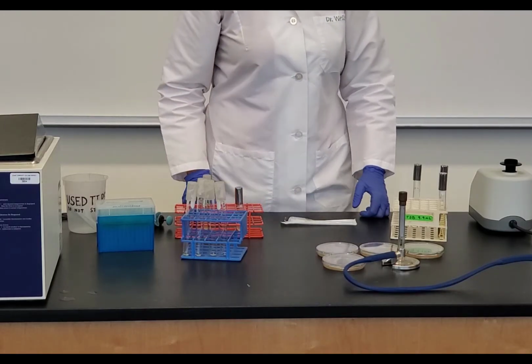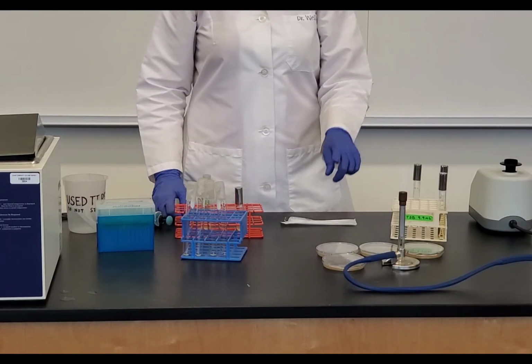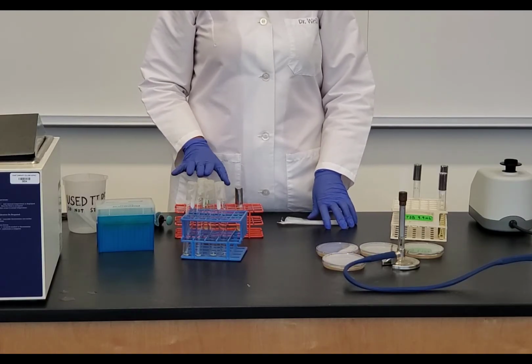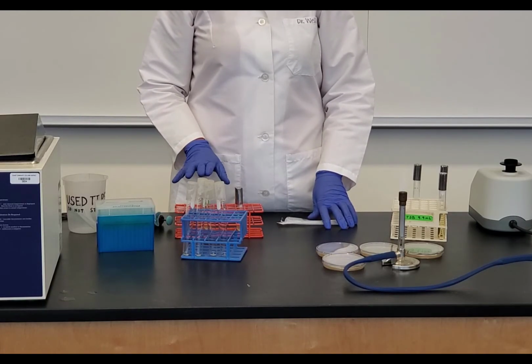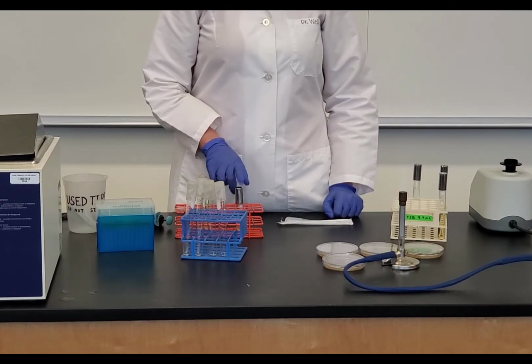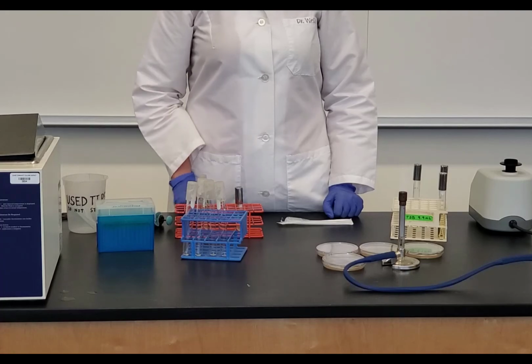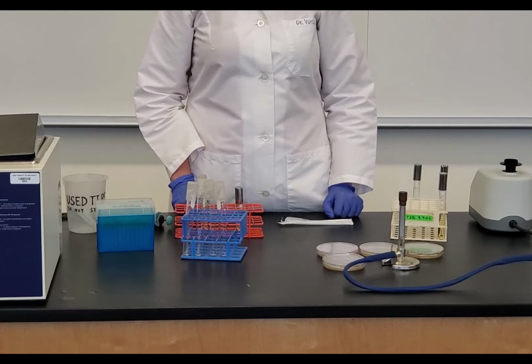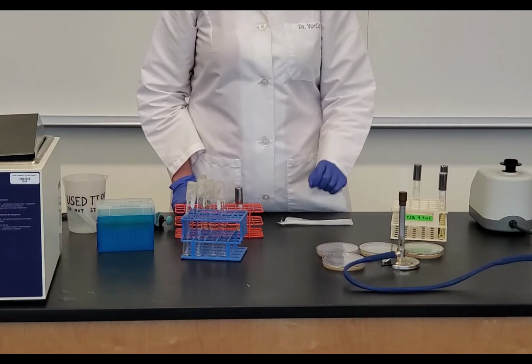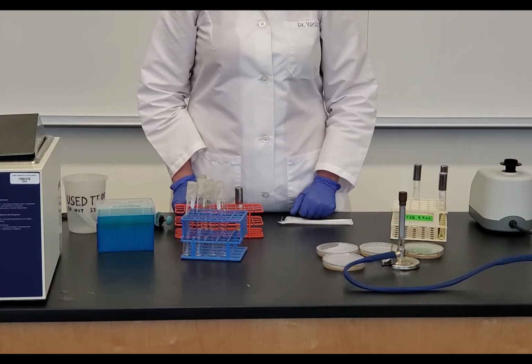Now I have poured all 4 of my plates. So all 4 of my plates have the same concentration of E. coli. The E. coli is just there as the host cell. And then I have plated my various serial dilutions of my phage stock, because my phage stock is what I'm trying to determine the titer. So I have my 10 to the negative 4, my 10 to the negative 5, 10 to the negative 6, 10 to the negative 7.